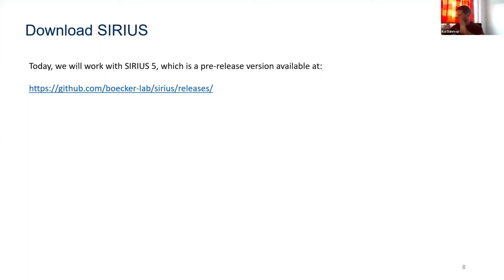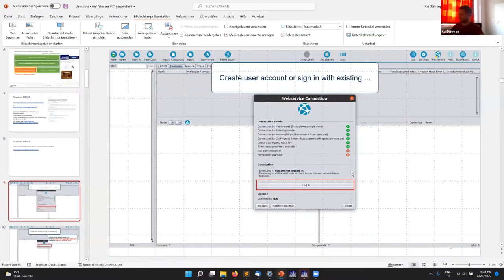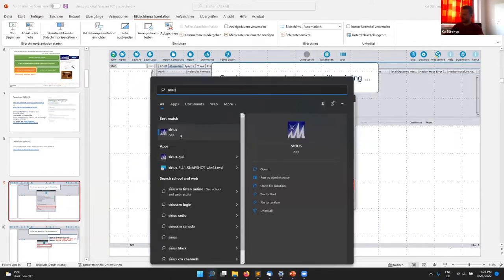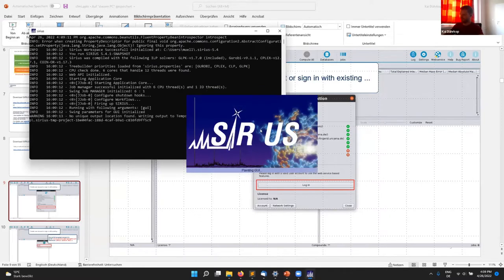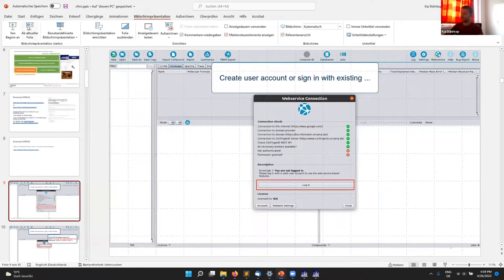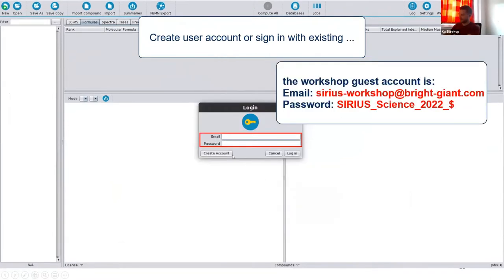If you install it on Windows, you'll get a warning that it's an unknown program that could be a virus. It's not a virus — you can just install it. After installing, it should appear in the Windows start menu. The first thing is creating a user account. A pop-up web service connection should appear with a login button, and you can create your own account with your university email address. Or you can use for this workshop the guest account with the email address and password I've already posted in the chat.